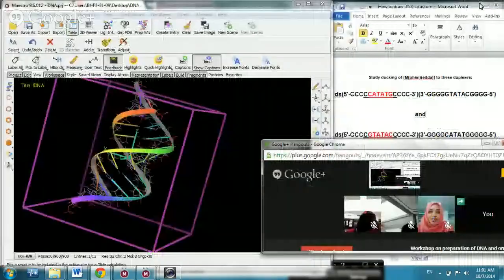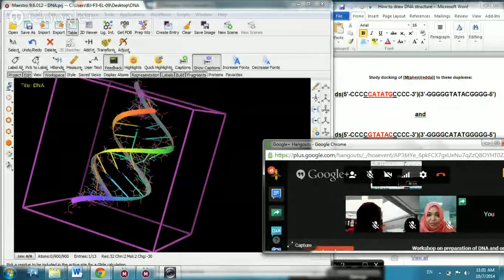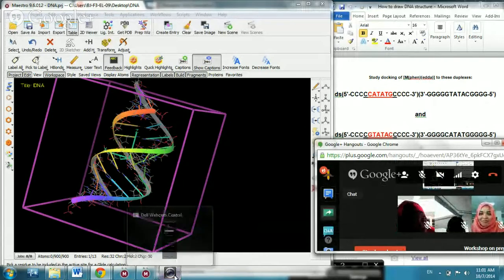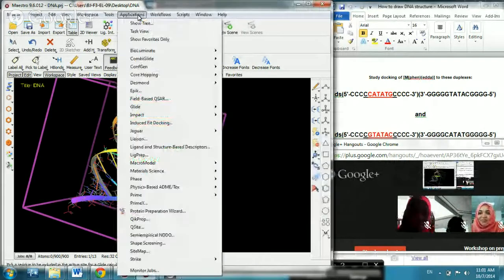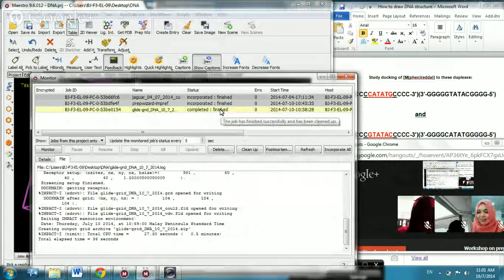Hello all. Can you all hear me? Yes? Okay, good. Let us check the status. Yeah, you can see the job is finished, right?